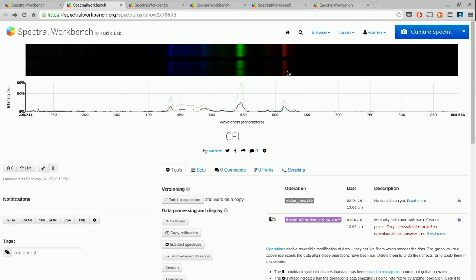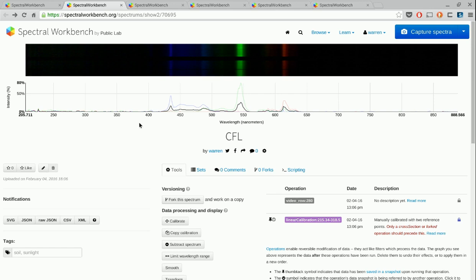Now, no matter which one of these you use, the process would be the same. Note, these are already all calibrated, but I'm going to go through the calibration process again, so that you can see what it looks like. What's interesting about these peaks is that they're produced by mercury, mercury vapor that's in the bulb, and we know where some of them ought to be. So we can use those as sort of signposts.